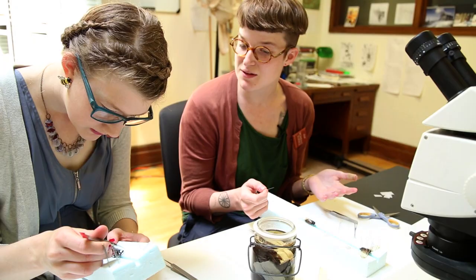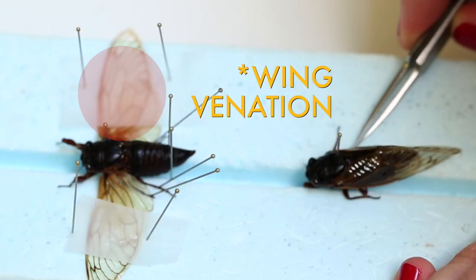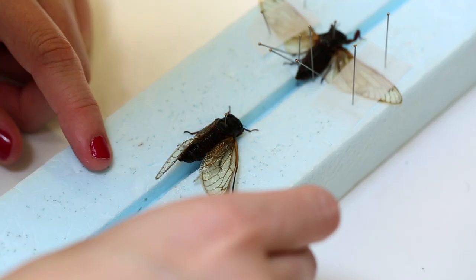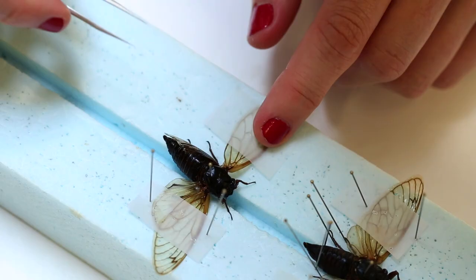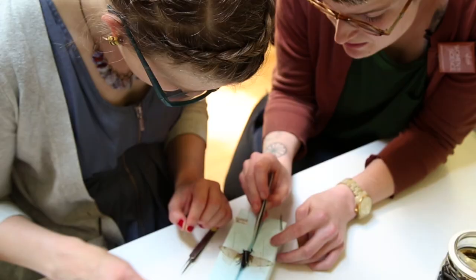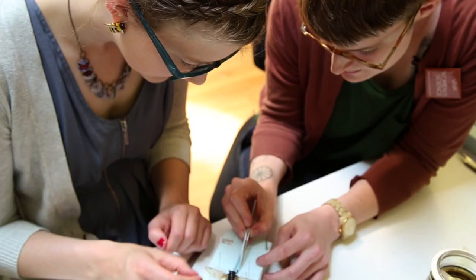I use a decent amount of pins when pinning an insect — some people are more particular about the legs being symmetrical. Spreading the wings lets you see all of the wing venation and morphology. You can use your forceps to pull the wing out without putting a hole through it, or you can use vellum — we use vellum because you can see through it to view the wings underneath. Be careful when you grab the legs: the tarsi is the fragile part at the end that usually breaks.